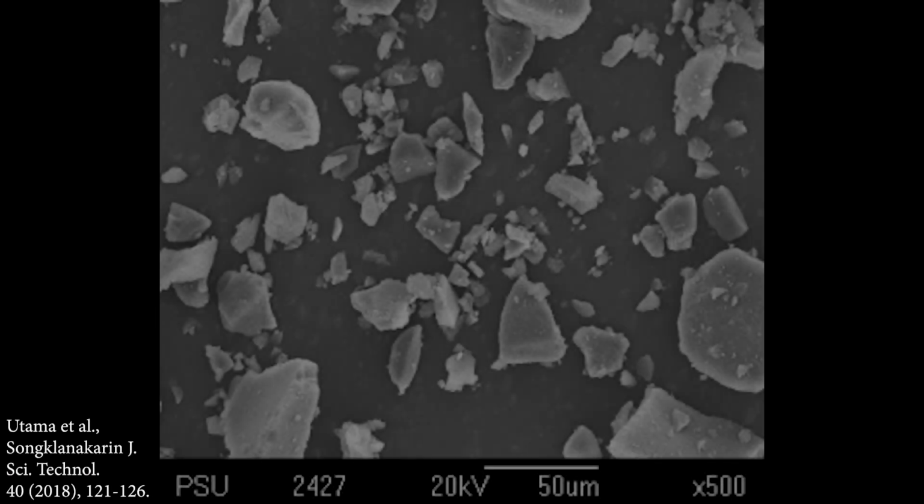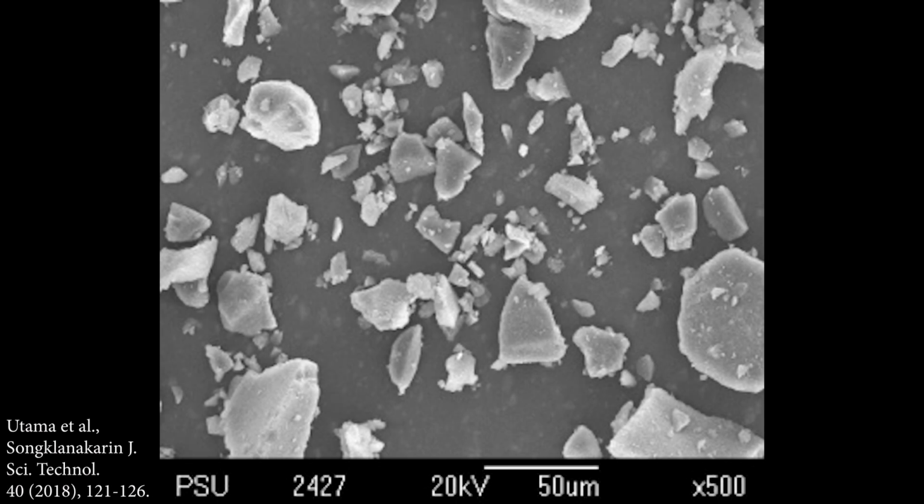Now, if we look at silica under an electron microscope like we've shown here, these particles vary from 50 to 60 microns or even up to 100 microns. And if we're just doing a simple organic silica column, we don't really care that much about the particles. But for analytical separations, the particles' size, the distribution of sizes, and their shape are really important.